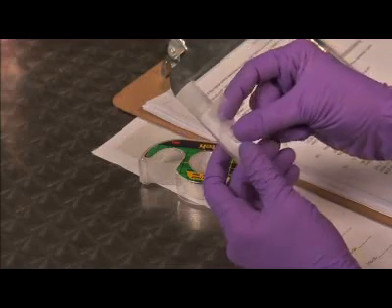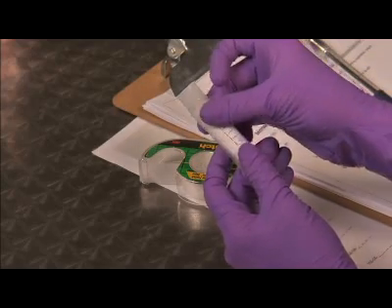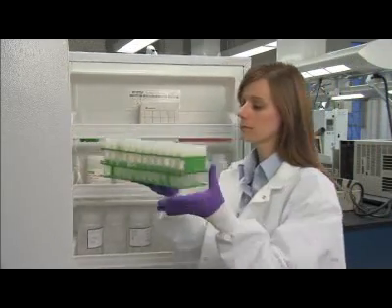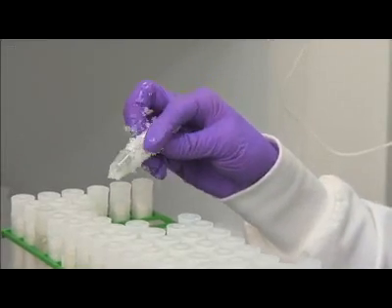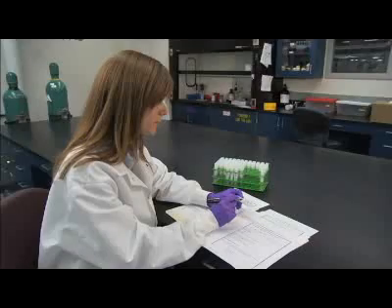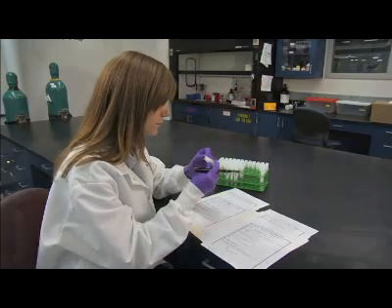The weatherproof labels are important as they are designed to withstand moisture. Once the samples are in the freezer, they may gather ice or frost on the outside. If the label is not weatherproof, it will quickly deteriorate once taken out of the freezer and the ice is wiped away. Then you won't be able to match the sample up to any information gathered from the participant. For example, if they were a smoker.